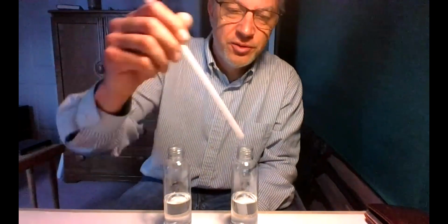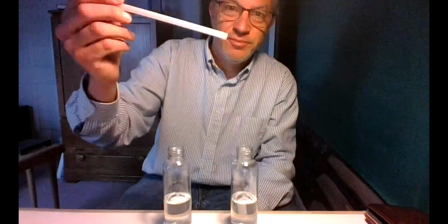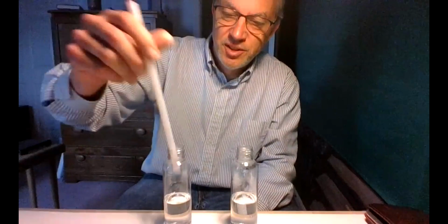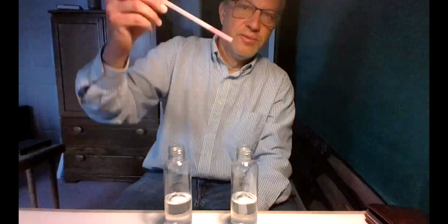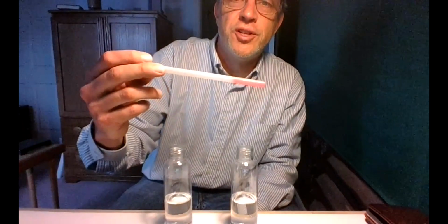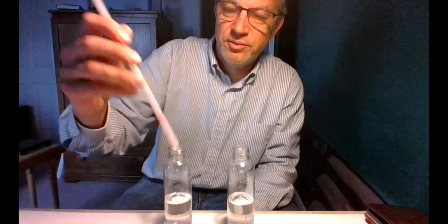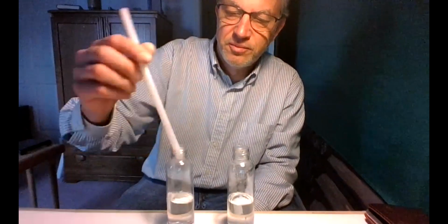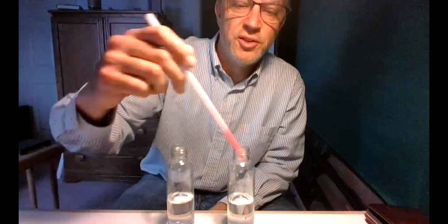Here's the straw. Put it in the liquid. Pull it up. Nothing, not much happens. Put it in here. Starts to change colors. Okay, changing color. Gone. Okay, so I know you can see it there, but definitely changing color.